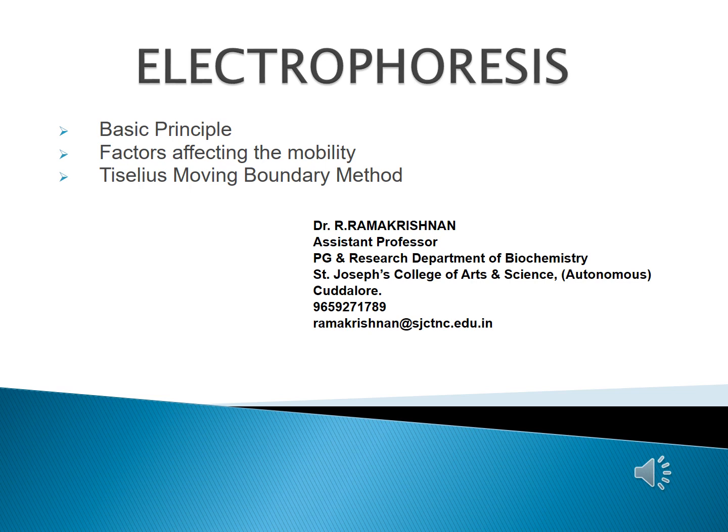In today's program, I am going to discuss the basic principles involved in electrophoresis, the factors which affect the mobility of the particle during electrophoretic separation, and, as the next part, the very first introduced electrophoretic system called moving boundary electrophoresis. Under that, the basic principle involved, instrumentation, merits and demerits of moving boundary electrophoresis.